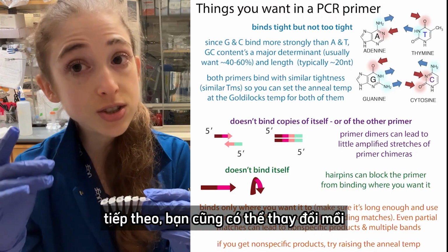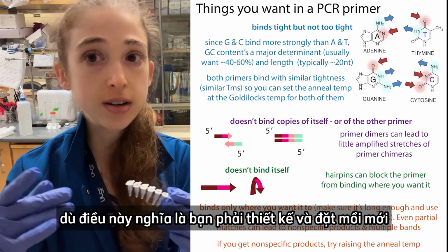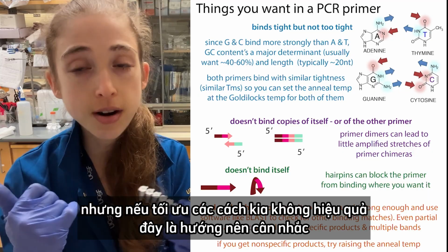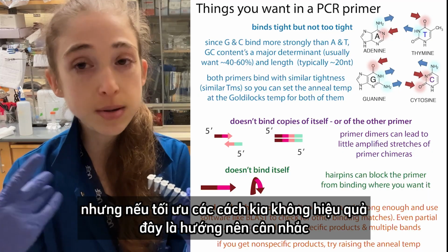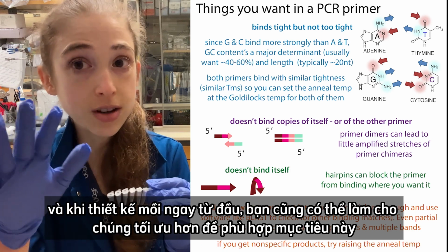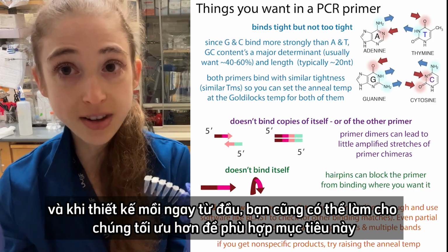But what you can also do is change your primer. Although this means, yes, you have to design a new primer and order a new primer, if you're not having luck with the other optimization methods, this can be a good bet. You can also make sure that when you're designing your primers in the first place, you make them ideal for this.